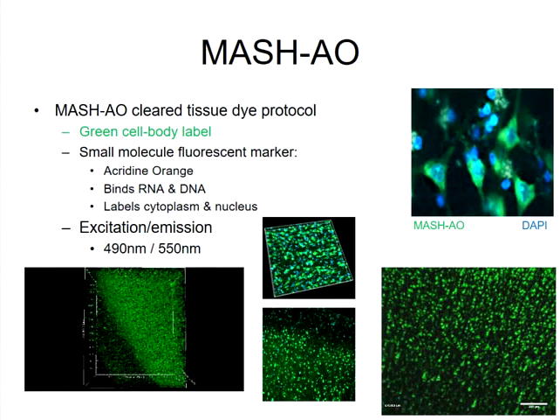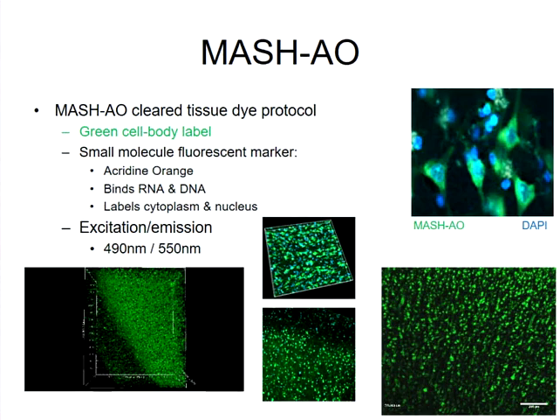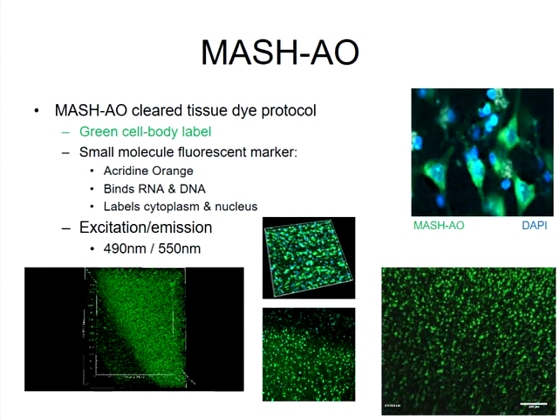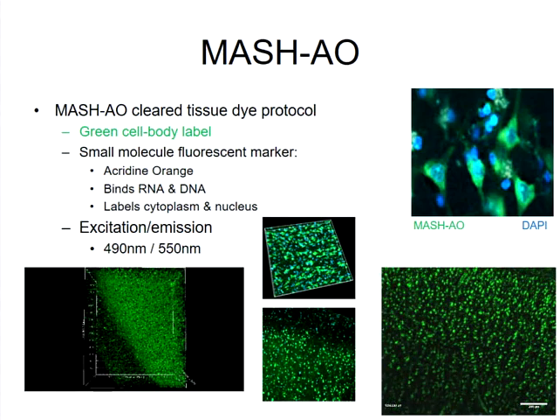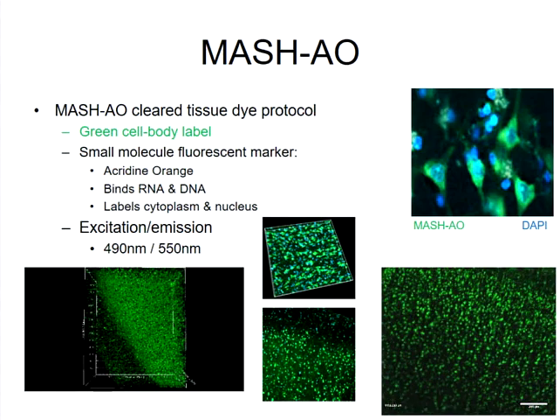in area V2, where you can see that we can go all the way in 3D through a stack of tissue and keep imaging all the way to the depth of the tissue. Showing some results then for the red label.